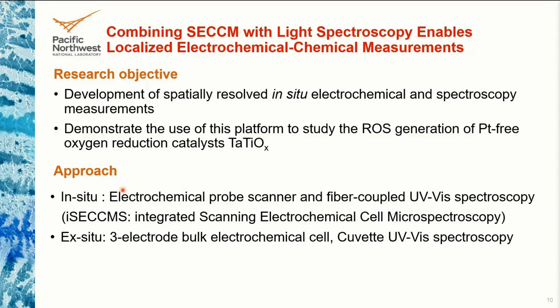So basically, in this research, we perform the SECCM scan in situ and also couple it with an ex situ technique to establish the reliability of the technique, so that we can establish it as a platform to monitor this free radical generation.